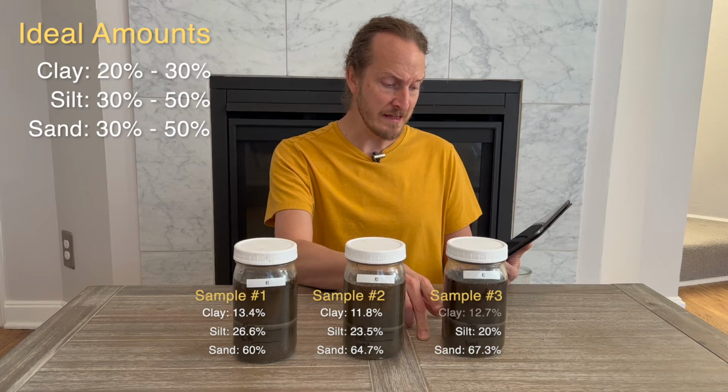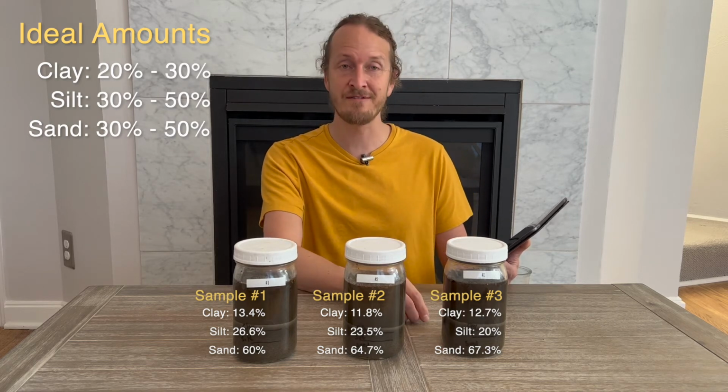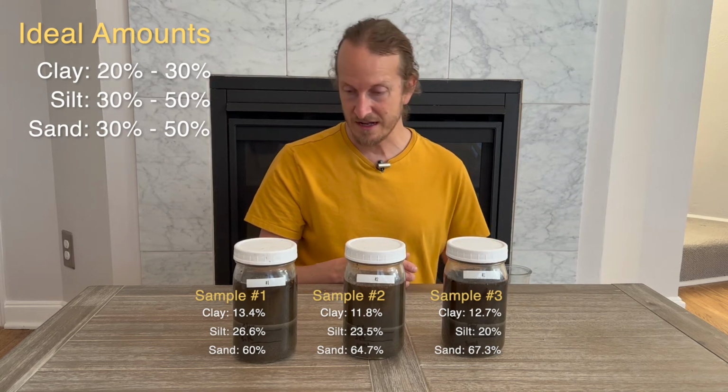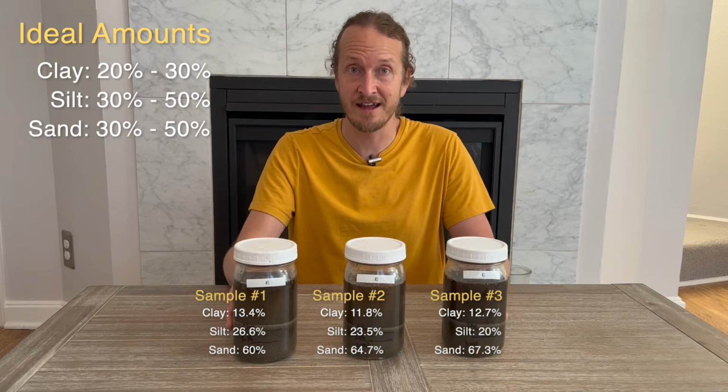And finally, 7 millimeters of clay is about 12.7%. So really they're all pretty similar. It looks like I have pretty heavy sand and pretty light clay.